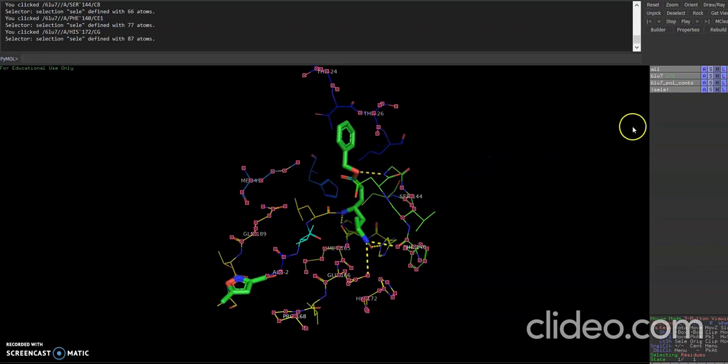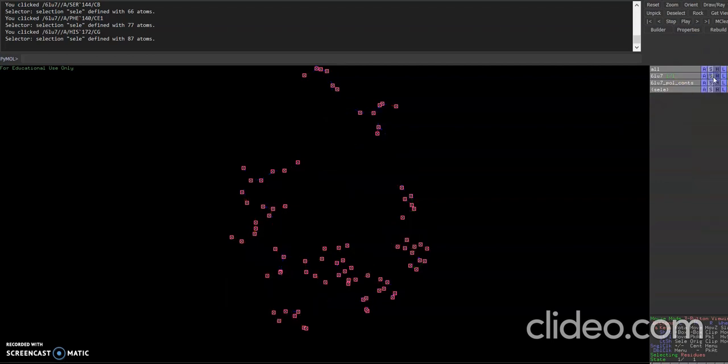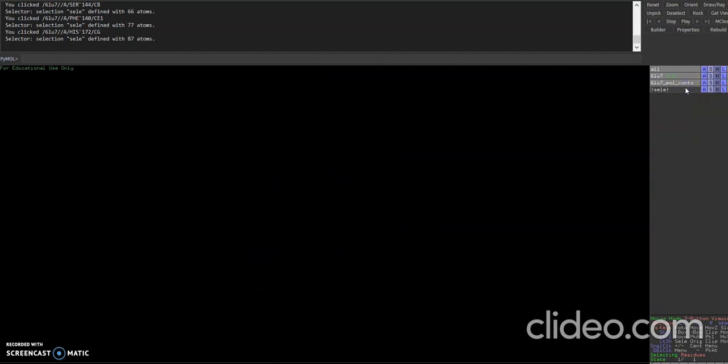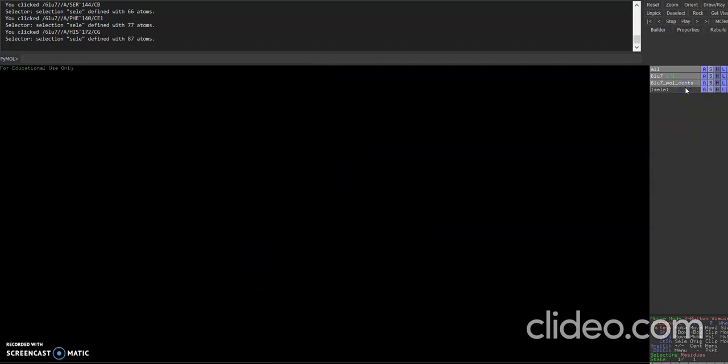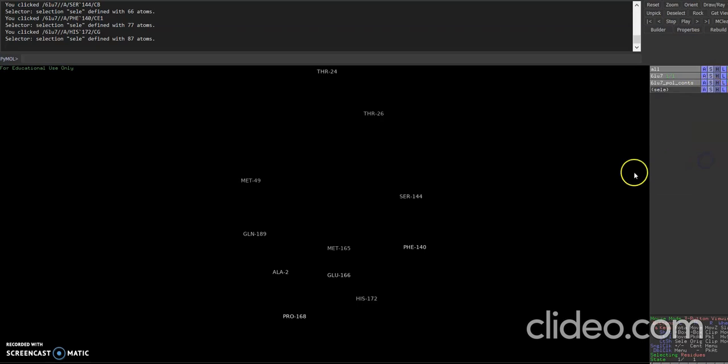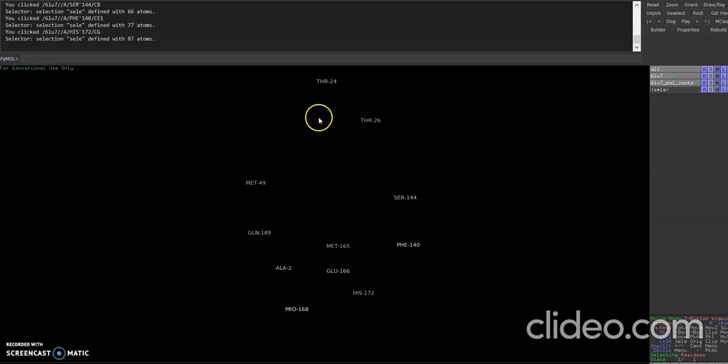Now to note them down, you can do one thing, go to hide for all and say hide everything. And then you come, click on selection tab to hide the points and then say show. And you can go to label and you can see all the residues that were labeled are here. You can zoom in and note these residues down and use it while docking. These are the active sites in the protein.